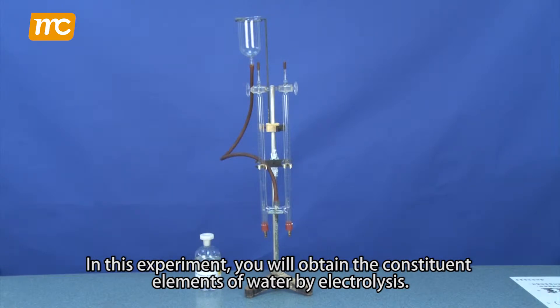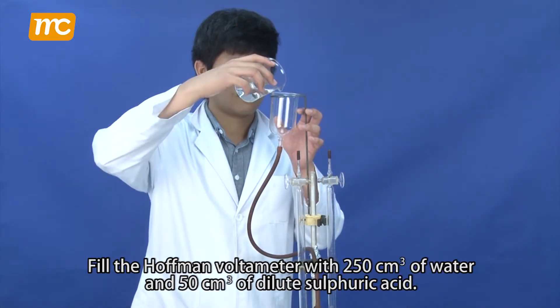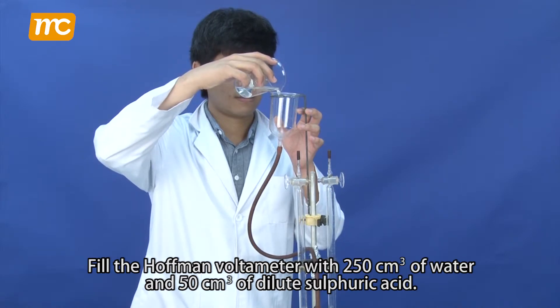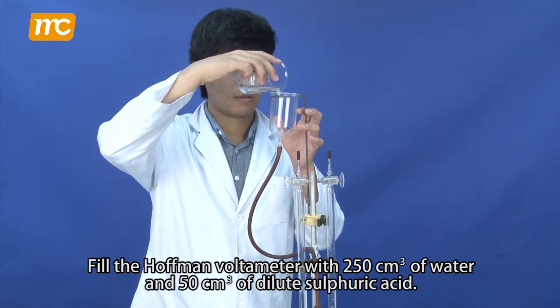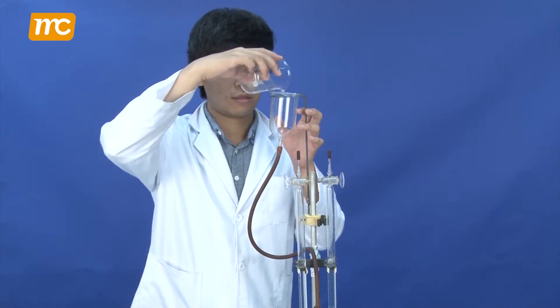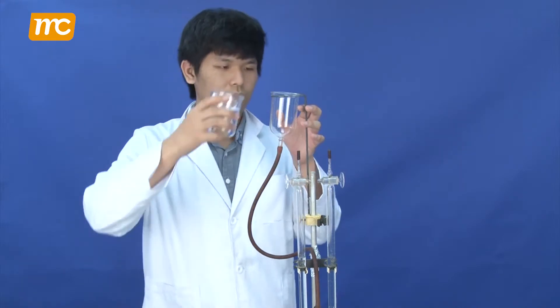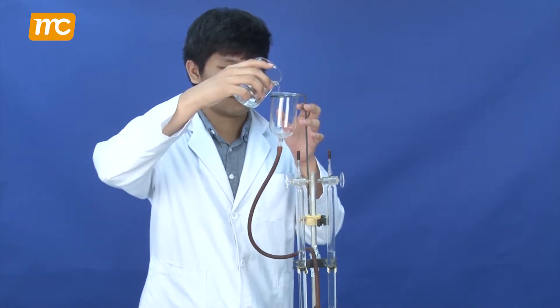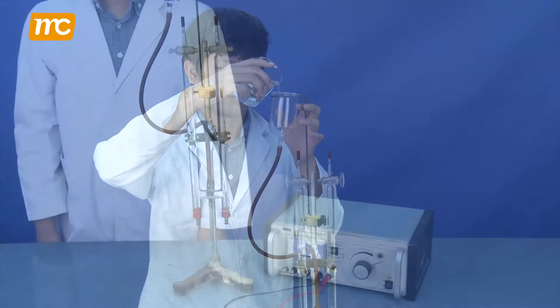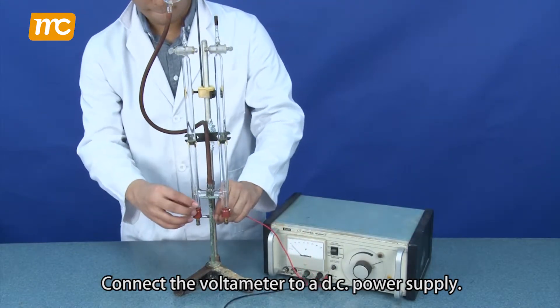In this experiment, you will obtain the constituent elements of water by electrolysis. Fill the Hoffmann voltameter with 250 cm³ of water and 50 cm³ of dilute sulphuric acid. Connect the voltameter to a DC power supply.